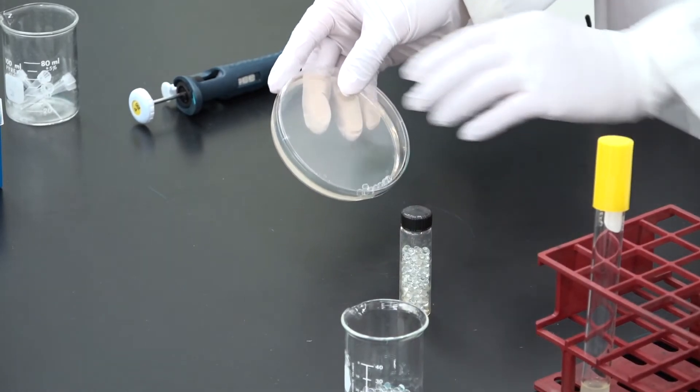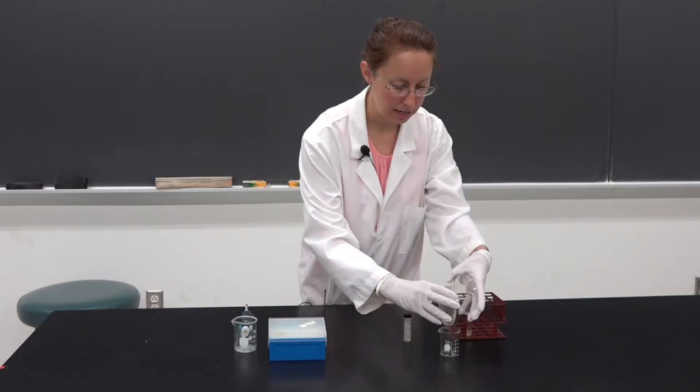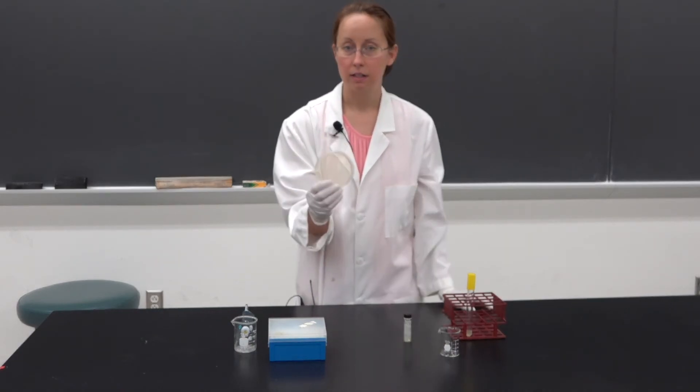Once you're finished, tap them all to one side and empty them out into a beaker and the plate is finished.